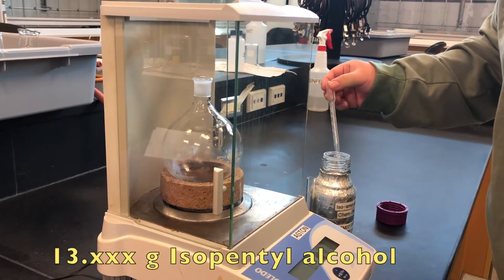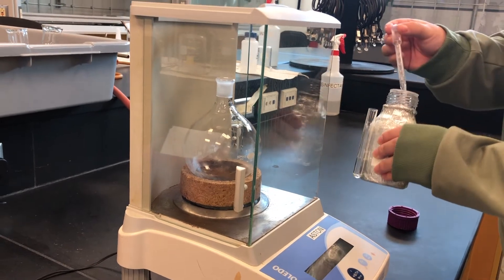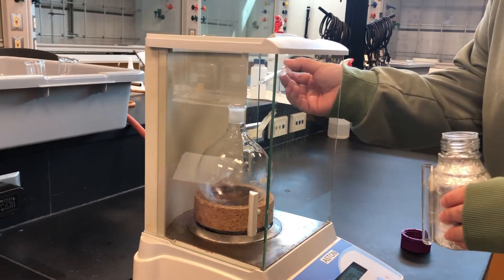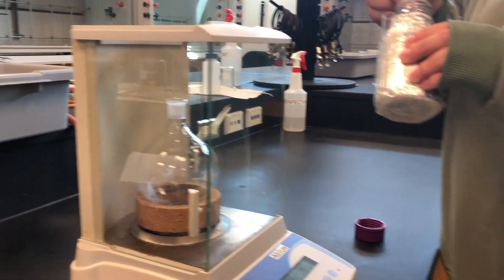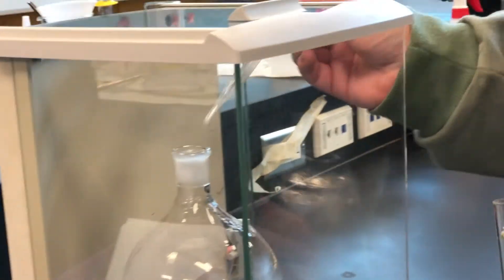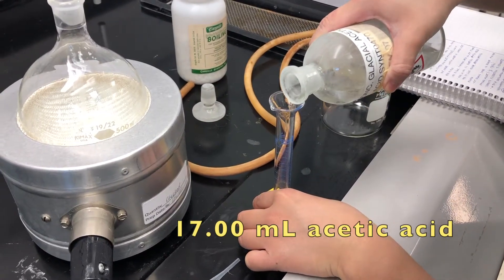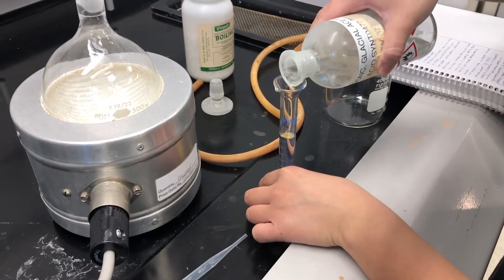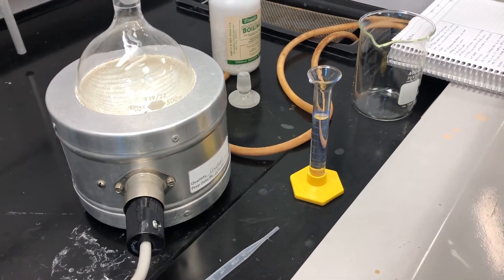For the first step, you must mass out the isopentyl alcohol in a 500 milliliter round bottom flask. Add 17 milliliters of glacial acetic acid, 1 milliliter of sulfuric acid, and 2-3 pieces of boiling stones.